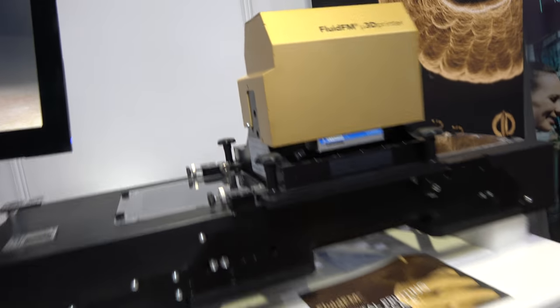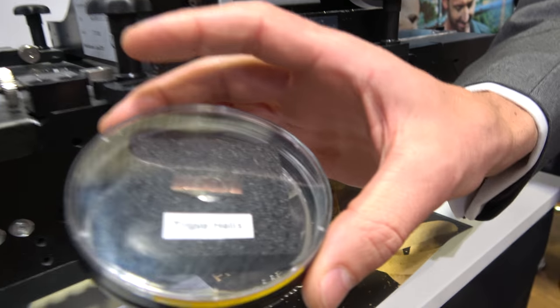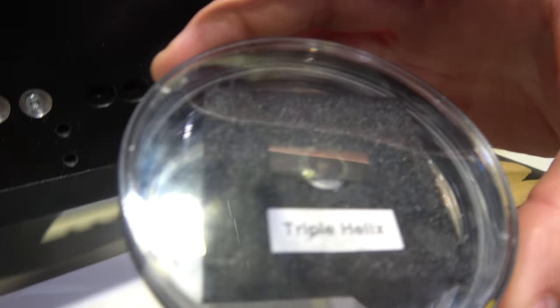And is this the sample that you have printed? Yeah, for example, you see here — what you can't quite see — it's a triple helix.